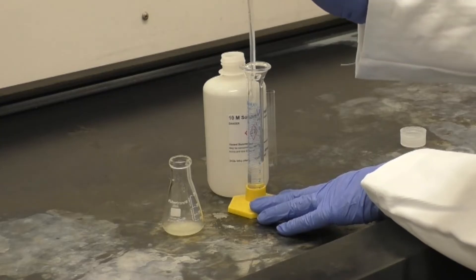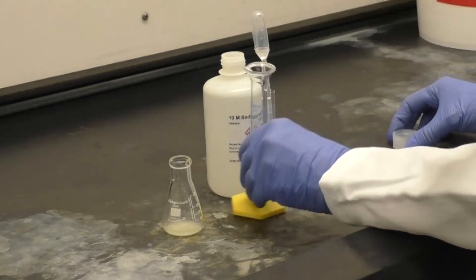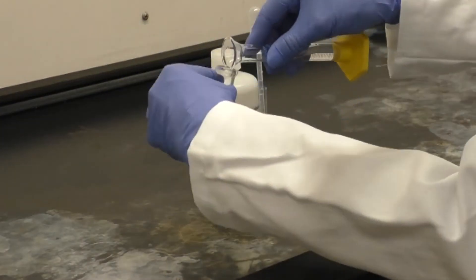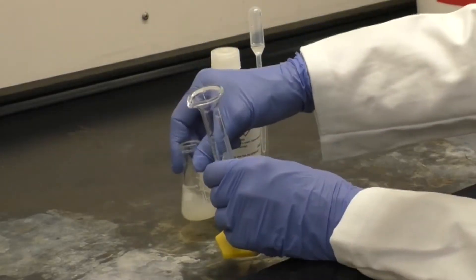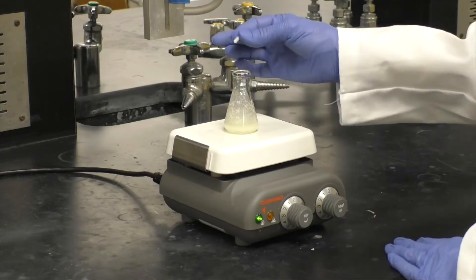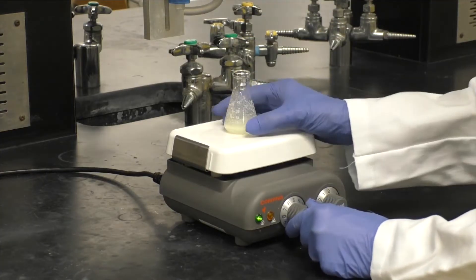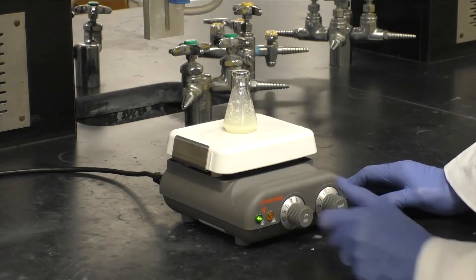Last, measure out 5 milliliters of 10 molar sodium hydroxide and add it to the flask. Put in a stir bar and stir for 20 minutes. A precipitate will form.